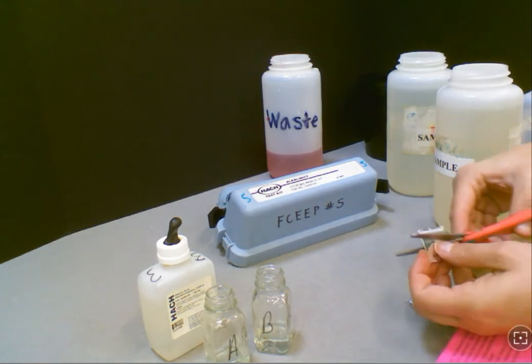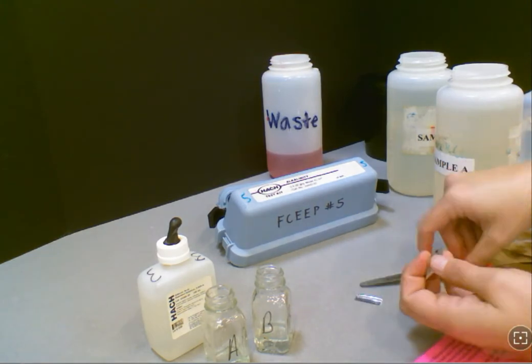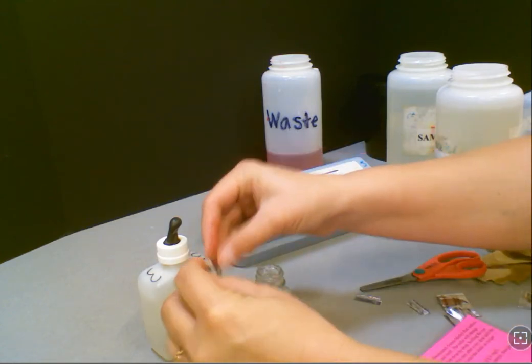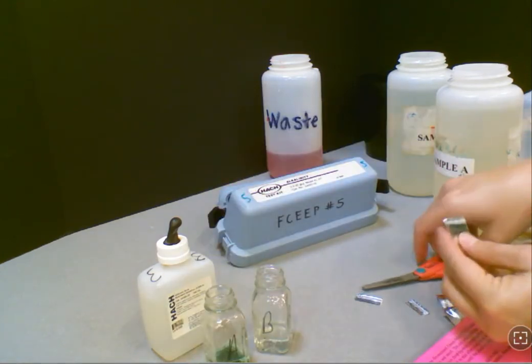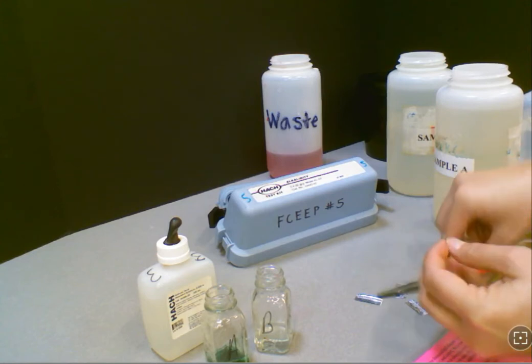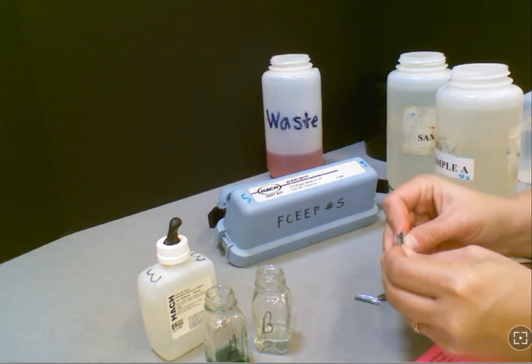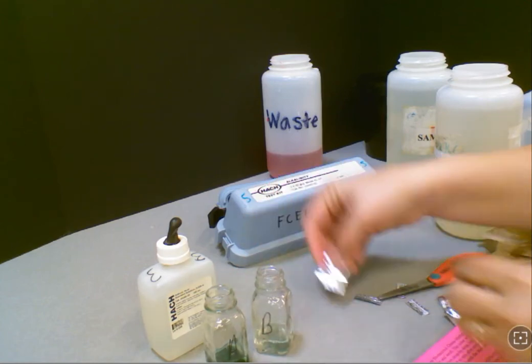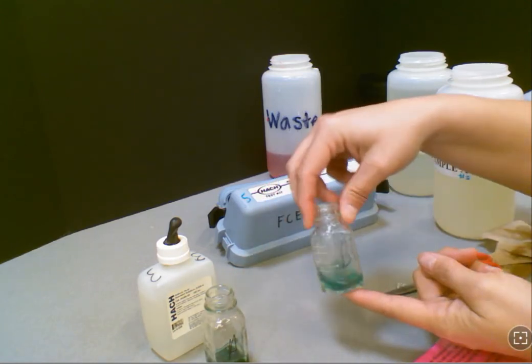After that step, you're going to add the brome-cresol-green-methyl-red powder pillow to both samples A and sample B, and you'll swirl those also.